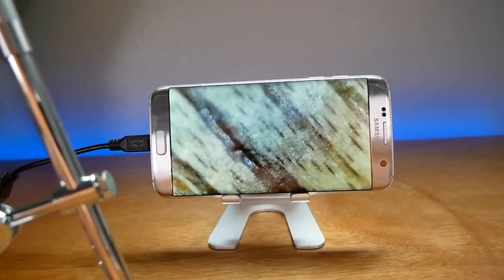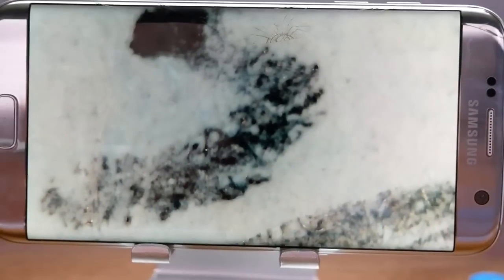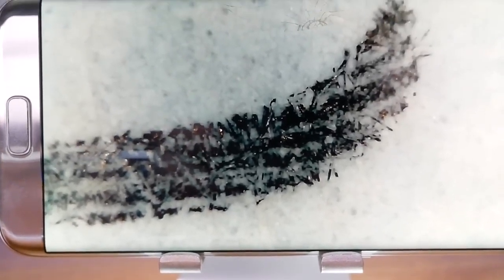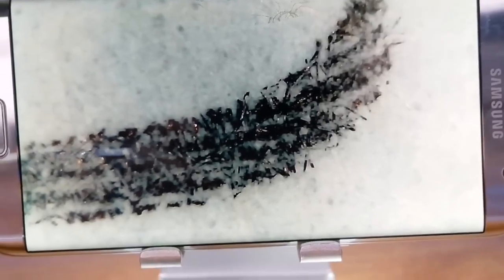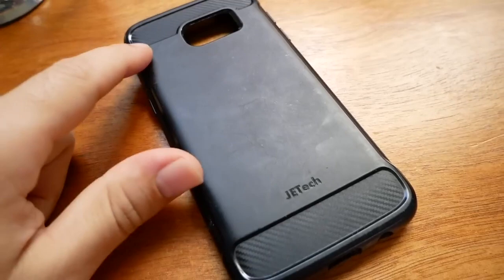The refresh rate is actually really good. You can see the pen that I was writing with on the paper and how the ink is laid down. That just blows my mind — it's amazing how you can see how a pen lays down the ink. Those are the ink particles on that paper.